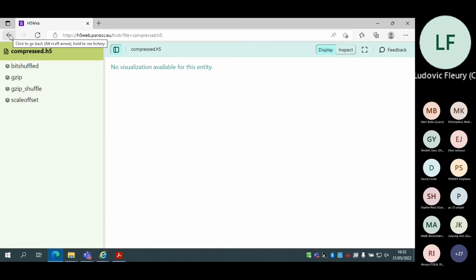Now, this is really a call for action here. If you think that you have some ontology that can fit in H5Web, then come to the discussion on Thursday, get in touch with us, send us an email, and we can discuss and then we will try to develop something, and if possible, we will try to develop the abstraction so that in the future, other ontologies can be easier to develop. Yeah, thank you. Definitely, we will be there.